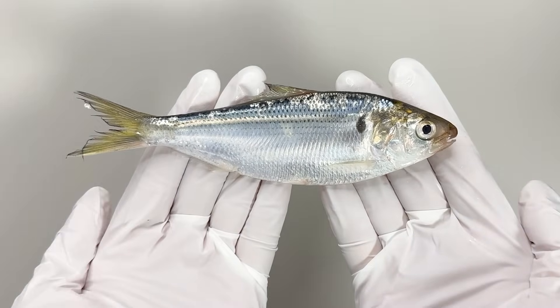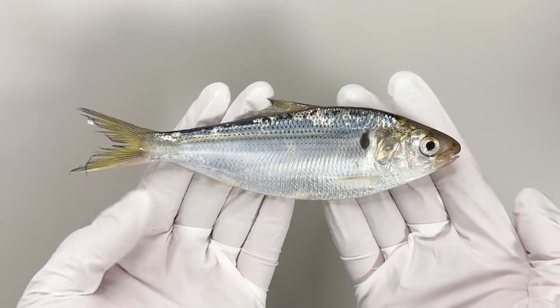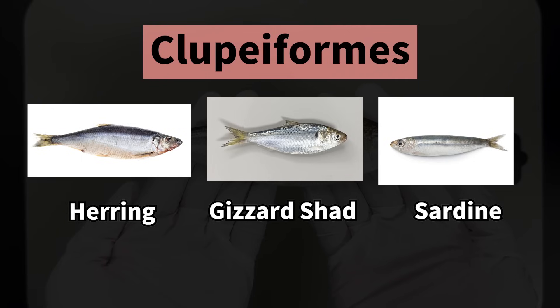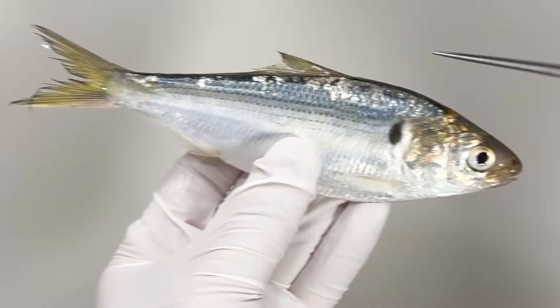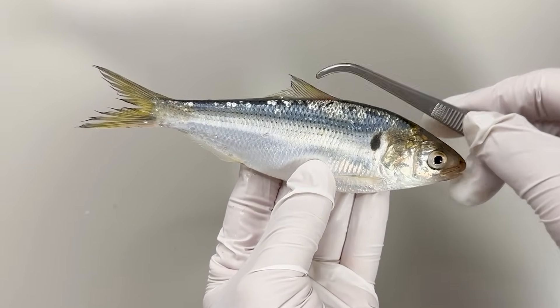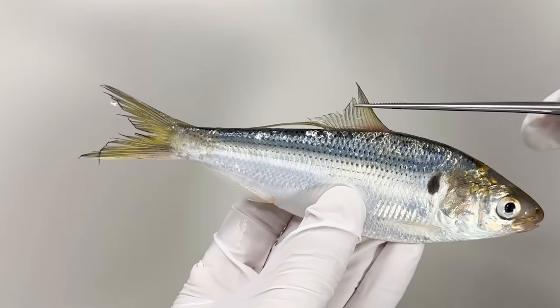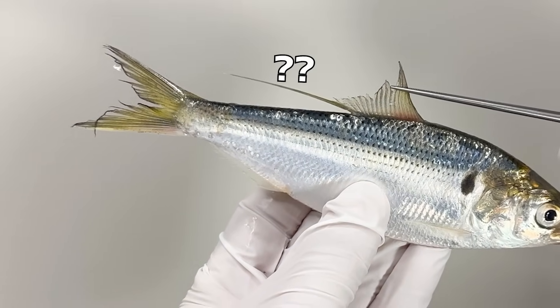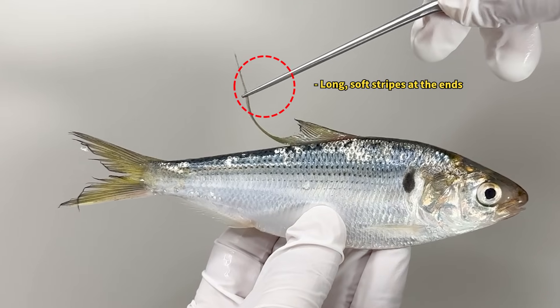The Gizzard Shad is a fish known by different names at different stages of growth, with its name changing as it grows. It belongs to the order Clupeiformes and resembles herring and horse mackerel, but it can easily be distinguished by the spot on the side of its face and shape of its dorsal fin. The shape of the dorsal fin is a simple way to differentiate Gizzard Shad from herring and horse mackerel if you pull on the dorsal fin.